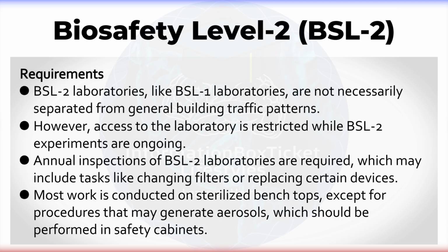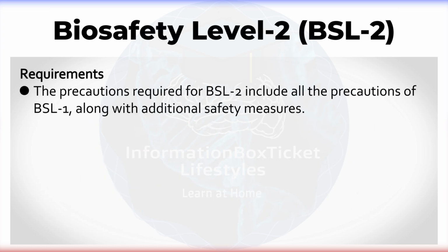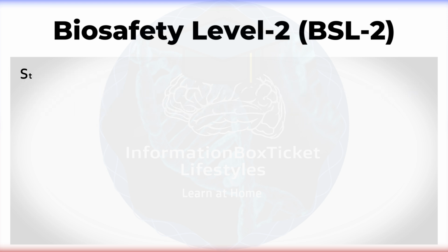Most work is conducted on sterilized benchtops, except for procedures that may generate aerosols, which should be performed in safety cabinets. The precautions required for BSL-2 include all the precautions of BSL-1, along with additional safety measures.